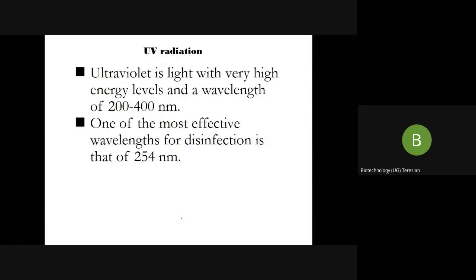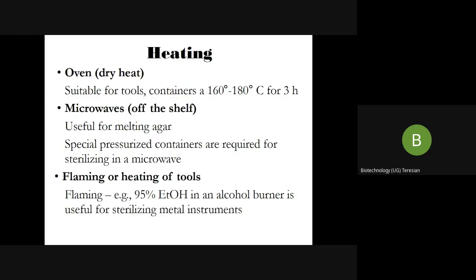UV radiation is germicidal and is present in the laminar air flow hood or cabinet; it can also be fixed in the room. It is non-ionizing radiation with a wavelength of 200–400 nanometers, with the most preferable being 254 nanometers. Precautions must be taken — you should not be present when UV radiation is on, because it leads to mutations.